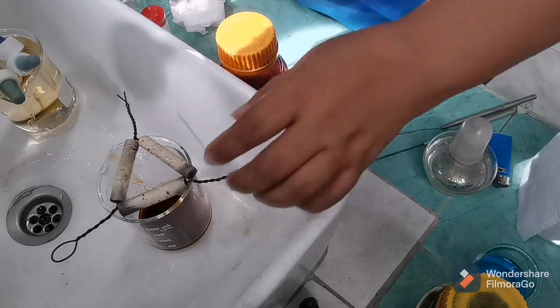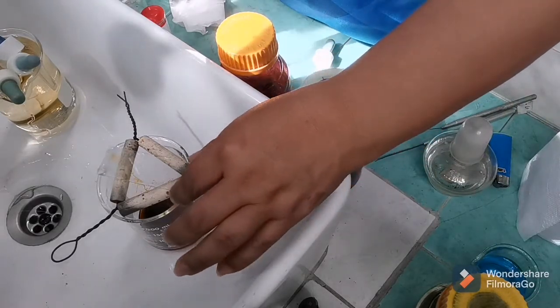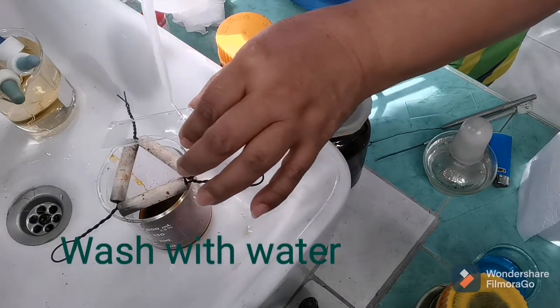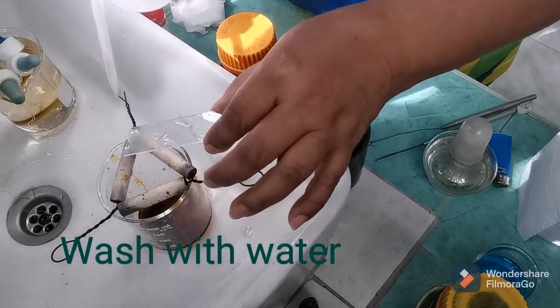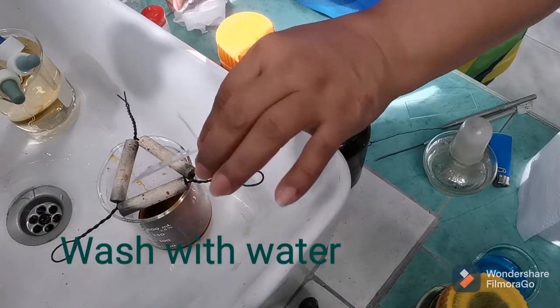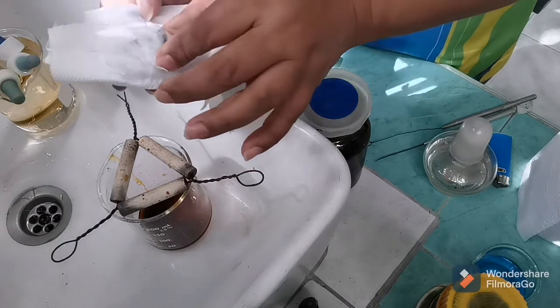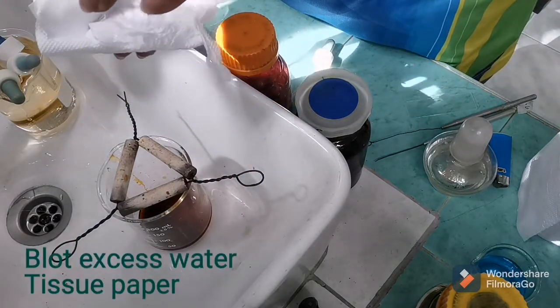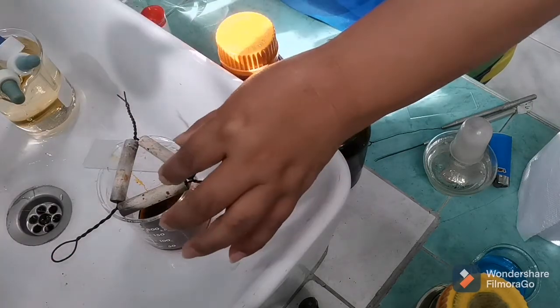After 30 seconds, again we wash this with water. We just simply try to remove the decolorizer before the counterstain.